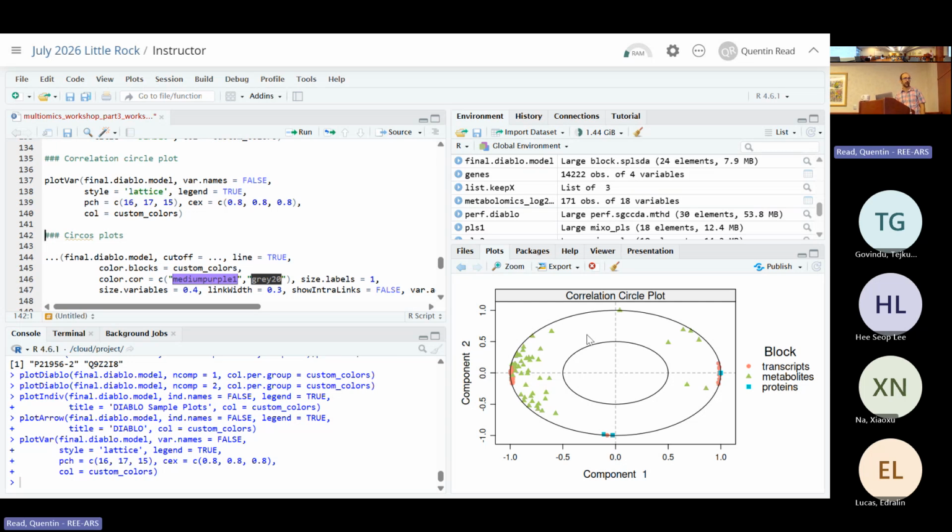The metabolites don't fall out quite as cleanly. I don't know why the cross-validation did it this way, but many that didn't have a super high correlation were retained in the final model anyways. So maybe there's a little more noise in the metabolome data, but the transcriptome genes that were kept are extremely highly correlated, either positive or negative, with the first DIABLO axis.